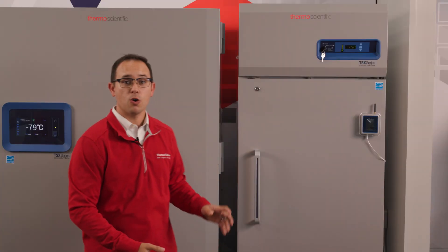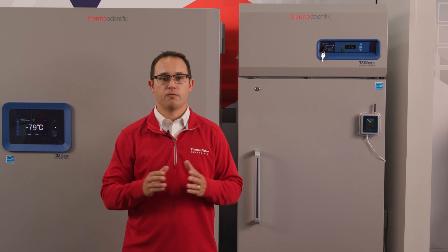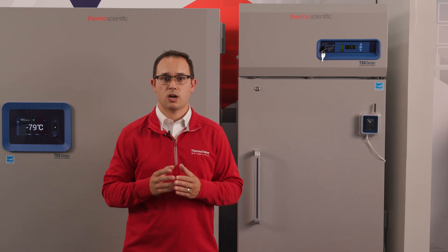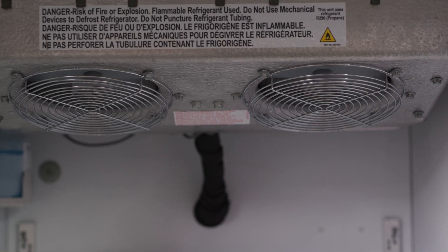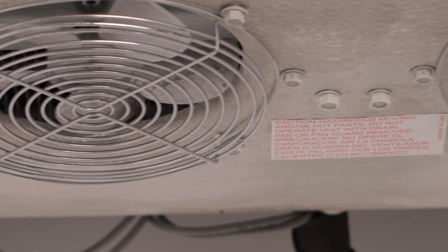If we shift over to an auto defrost freezer, here we can see a TSX series high performance unit. They have the same two main devices — a compressor and evaporator coils — but they work very similarly to refrigerators instead of manual defrost freezers, in that all those cold coils are housed in what are called an evaporator housing. Fans push air across these coils and down into the cabinet, creating a continuous air loop in the cabinet where warmer air is drawn in and colder air is pushed out. If we look closer at the components within that housing, we will find a few common parts: fans, which are used to move the air; evaporator coils, which is where the cold refrigerant is; and a heater, which is used to remove ice from the coils.